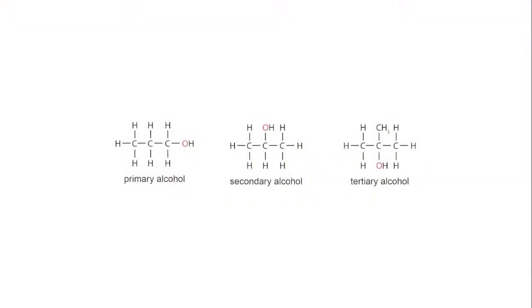To test for different alcohols, acidified potassium dichromate is used. The alcohols react differently, depending on whether they are primary, secondary or tertiary alcohols.